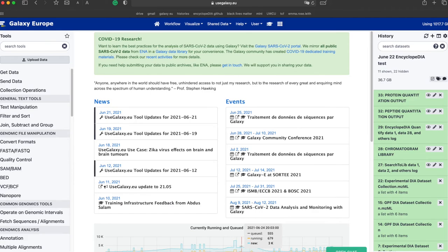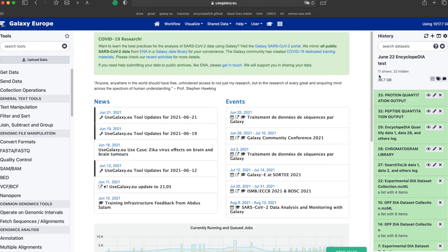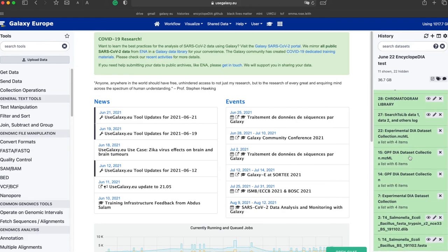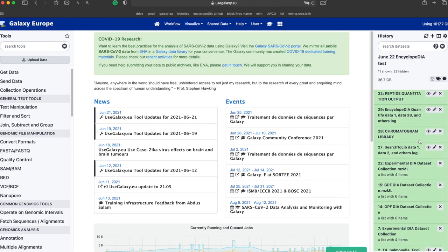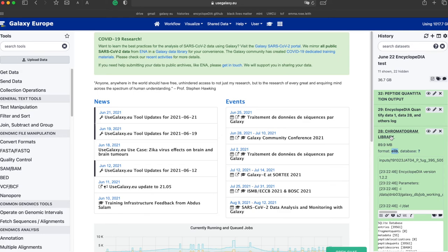Now that I have briefly explained the different parts of the Encyclopedia workflow and variations on it, let's take a look at the outputs from the test that we ran together on the IPRG inputs. The Encyclopedia workflow can take many hours, so while your workflow might not be completed at this point in the video, I have a history here from June 22nd in which the Encyclopedia workflow has successfully run on the same IPRG inputs. Scrolling down, items 15 and 22 in the list are the dataset collections of the experimental and GPF data once converted to the mzml format. Items 27 and 28 are outputs of Search2LIB — the log text file and the chromatogram library in elib format.